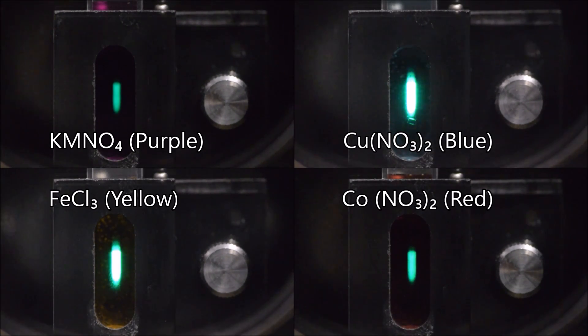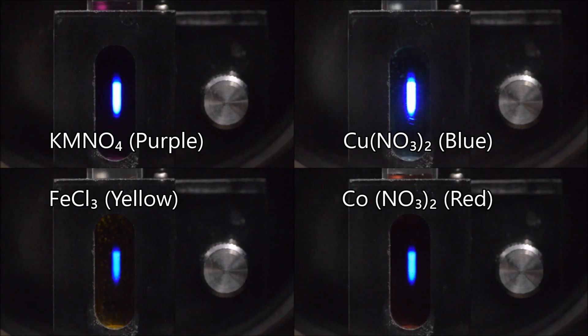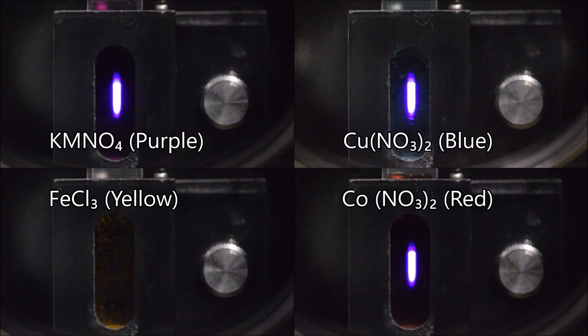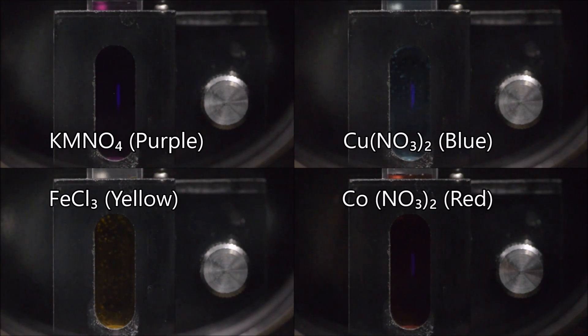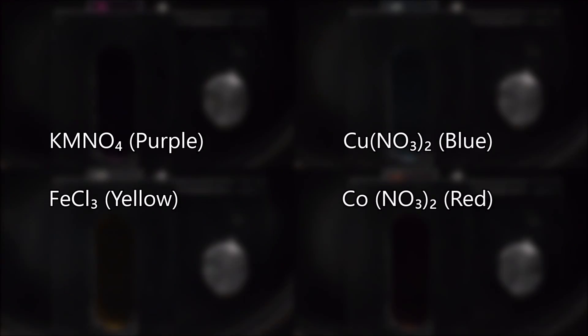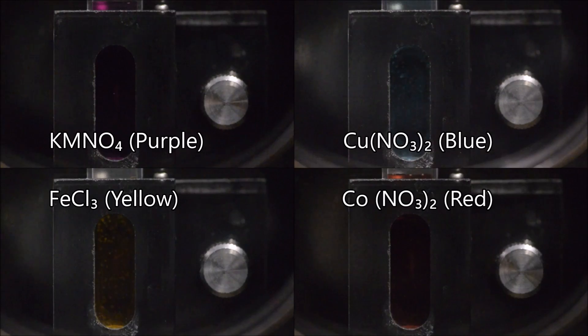If something appears purple it doesn't let any of the green light through it only lets blue purple and red through. If we look at yellow now we can see that yellow doesn't let blue light through and it doesn't let any purple light through and so only the yellow and some of the red makes it through to our eyes. It's pretty hard to follow all that so I've put that on again and we can watch it much more slowly you can see each of the colors appear and disappear depending on what the color of the solution is compared to what wavelength is being shown through the mixture.